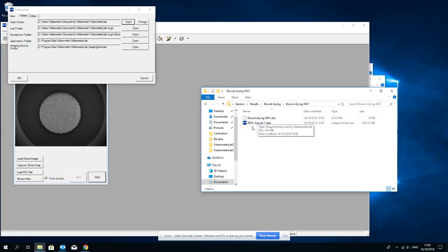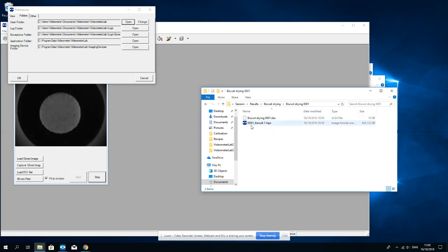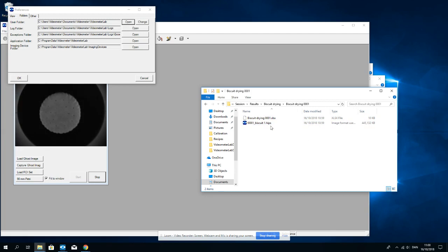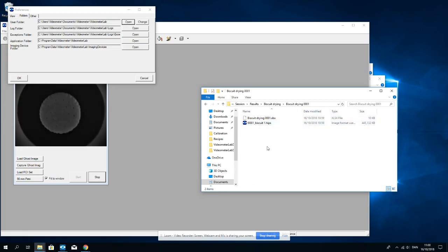But if I had let it been sitting there for two hours, I would have 24 images here and I could now go on analyzing these images.